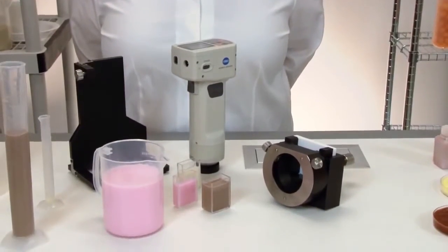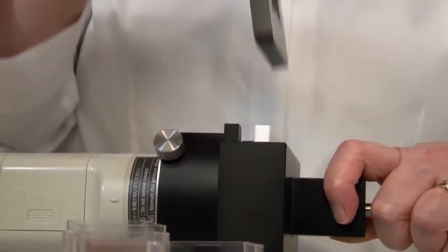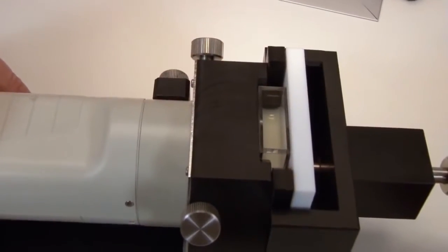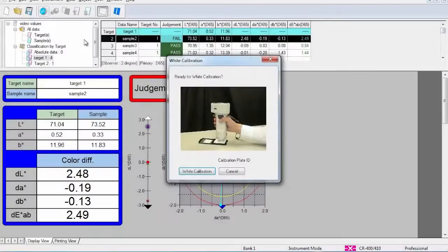Ideal for measuring reflective color and color differences including paste, powder, and opaque liquid, the versatile CR400 and CR410 have a number of optional accessories for various materials. For even more user flexibility, the CR400 series can directly interface to a PC with the optional SpectraMagic NX quality control software.